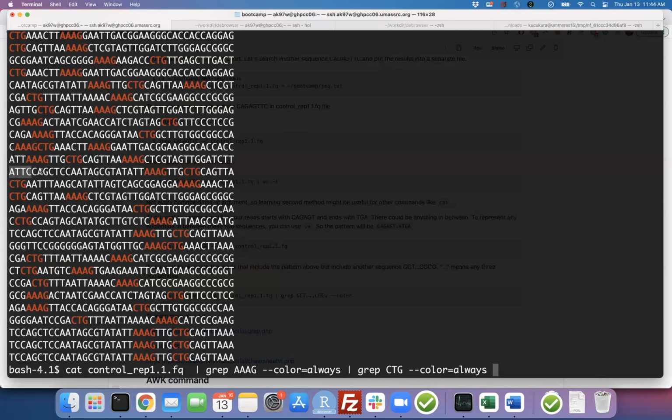They divide these reads into smaller chunks, and they preserve the order of the whole sequence, mapping them by masking some of the nucleotides and aligning them to the whole genome, allowing errors and finding locations in multiple parts of the genome sometimes, detecting the best origin of that read, scoring those reads, and telling you the coordinates. So you have to do such an operation to find the origin of the read in the genome. Not with grep. Grep is simple, just a couple of lines and fast, you get it right there.